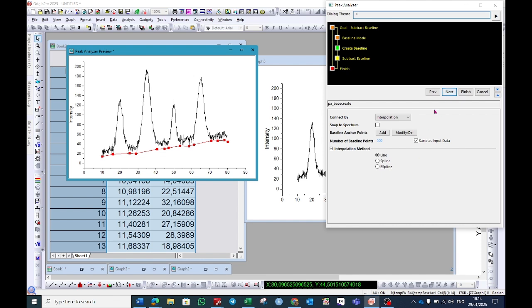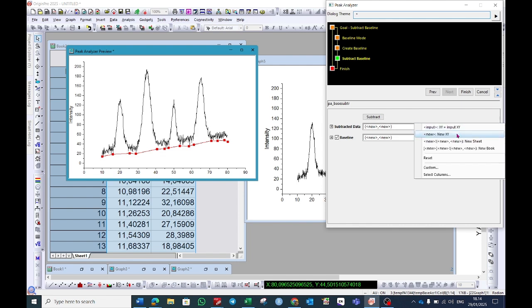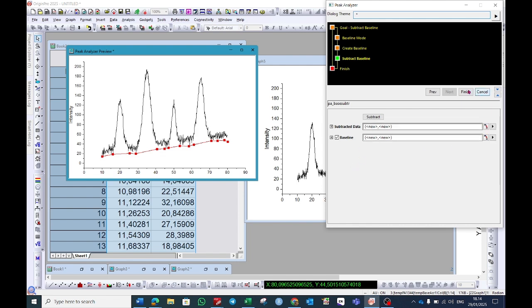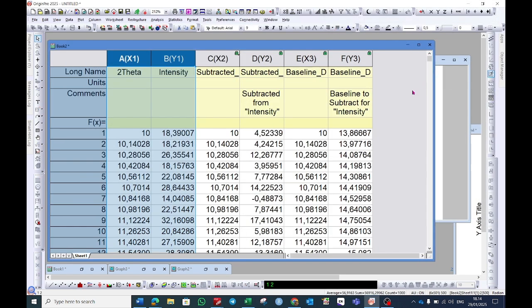And now create next. Here you will find the option subtracted data. Make sure it is appearing in the new XY option, and then click finish. So it will generate four different columns.